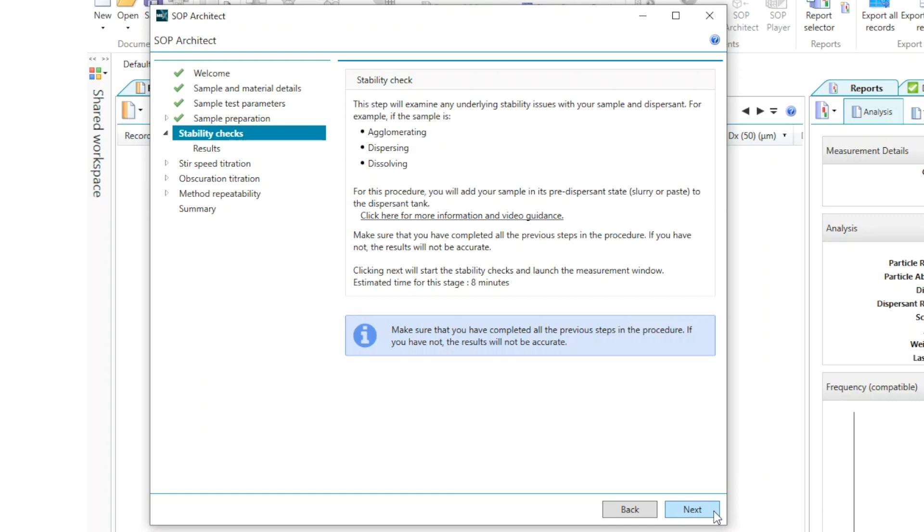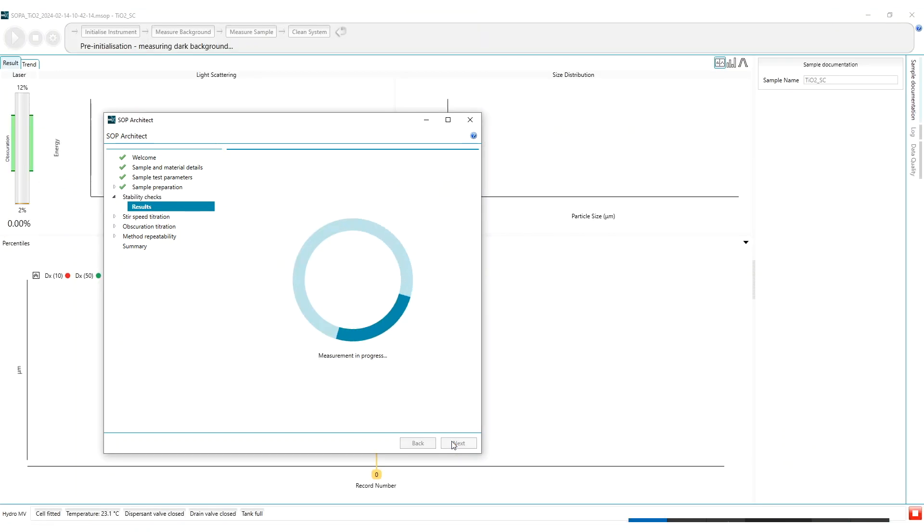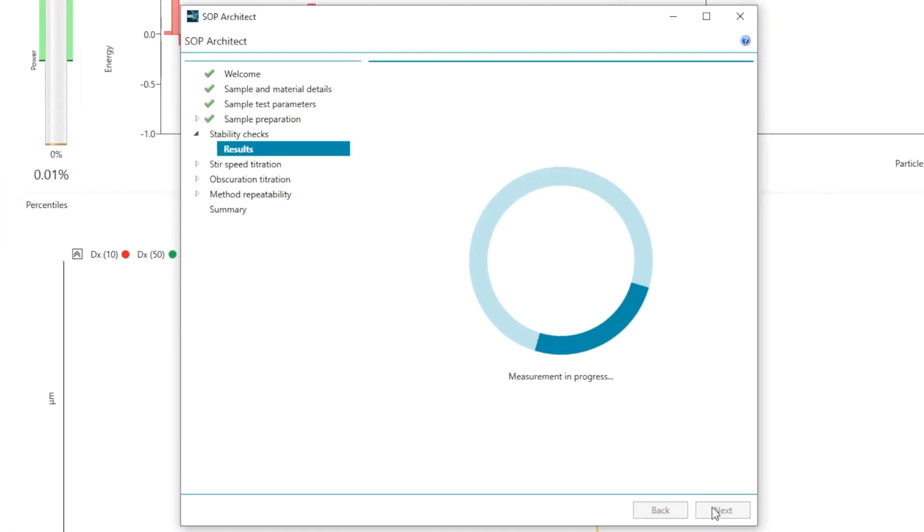So I will now carry out the stability check looking at this titanium dioxide sample in water. By clicking next we'll now open up the measurement manager window where the instrument is going to carry out the initialization and a measurement of the background.